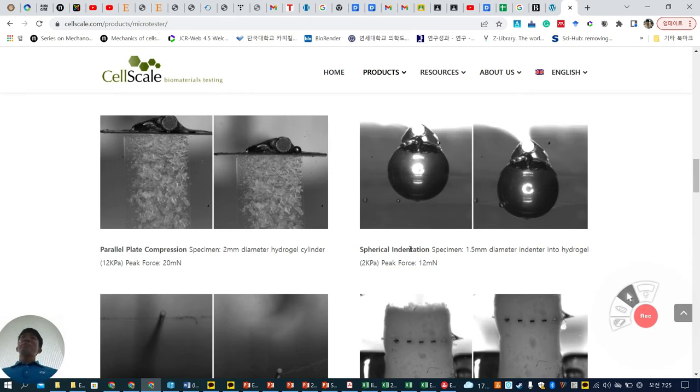Only they can measure the mechanical property down to 100s of micrometer. 만약에 플로레센스 같은 걸 볼 수 있으면, 셀 같은 경우는 달아가지고 디포메이션 될 때 셀이 느끼는 그거를 볼 수 있는데, 3억짜리 장비는 그게 돼 있어요. 이건 몇 천만 원짜리 장비라서.